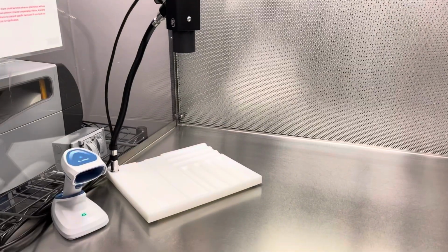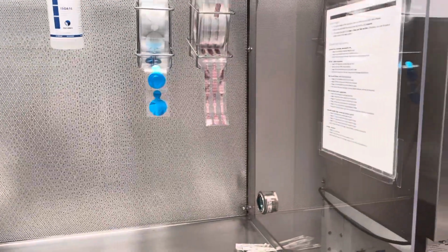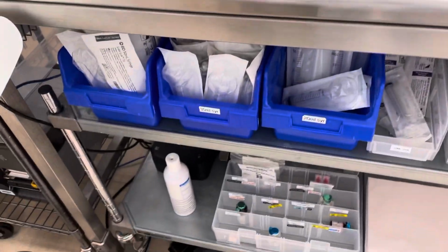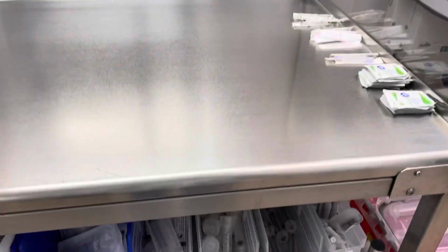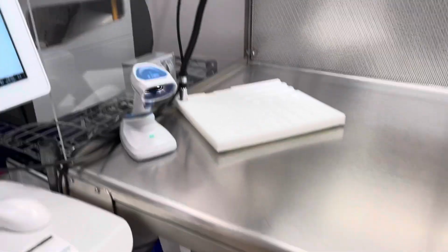Okay, and there's our camera and our scanner that connects to the computer. All of our seals, alcohol bottles, my swabs. I have more supplies down here for me. Okay, my sharps right here, my trash is right here. I'm going to start my compound here in a little bit. Let me show you what it looks like here.